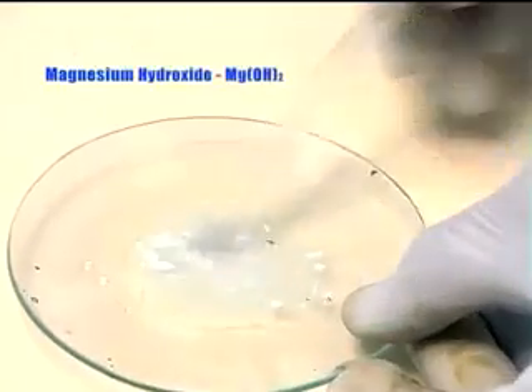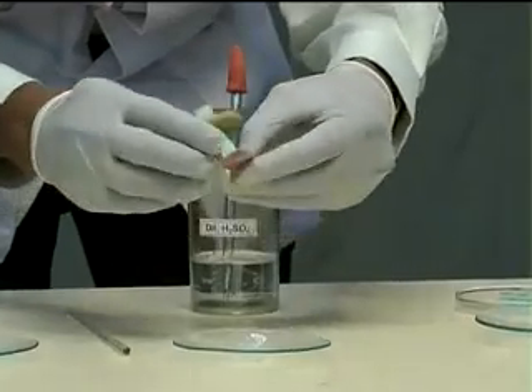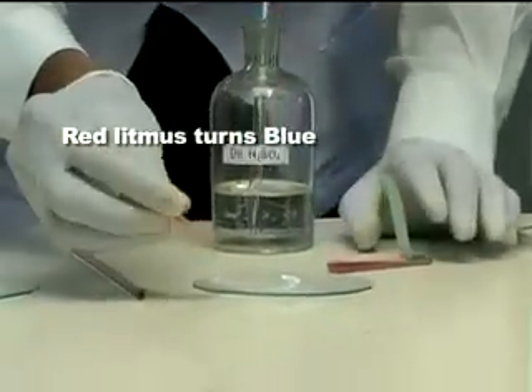Dissolving in water forms a weak base known as magnesium hydroxide. Red litmus turns blue, confirming that the solution is basic.